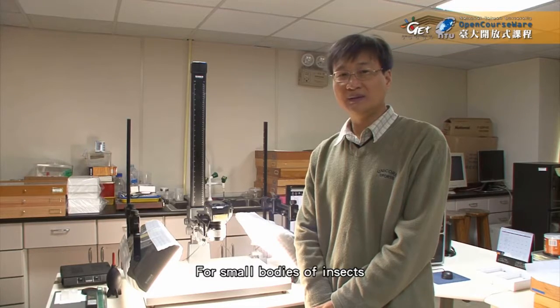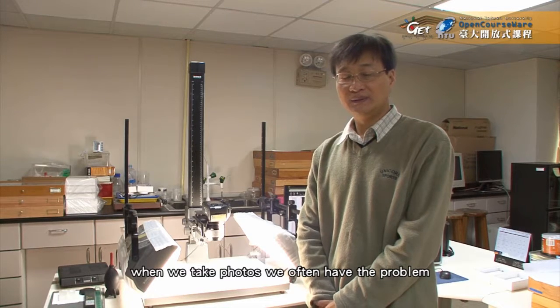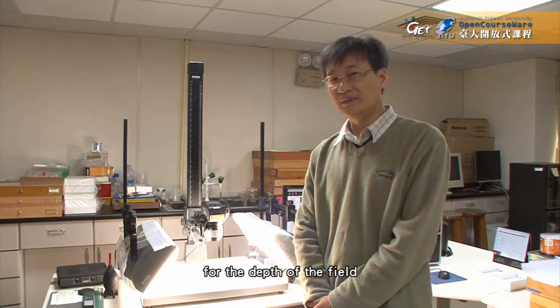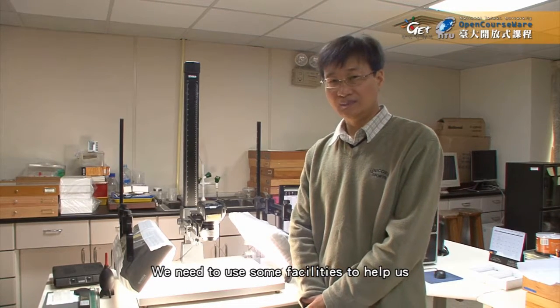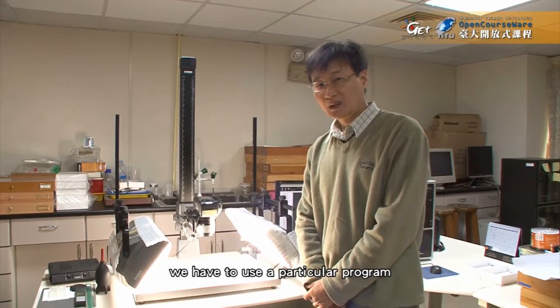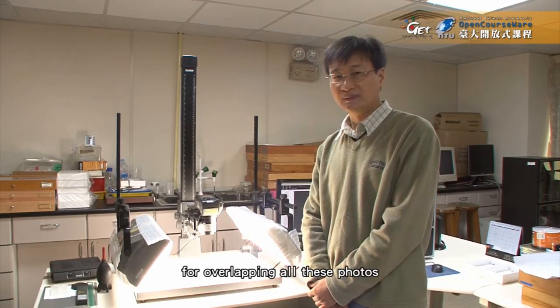For small bodies of insects, when we take photos, we often have problems with the depth of field, so we need to overcome this problem. We need to use some facility to help us. When we digitize the insects, we have to use a program for overlapping all these photos.